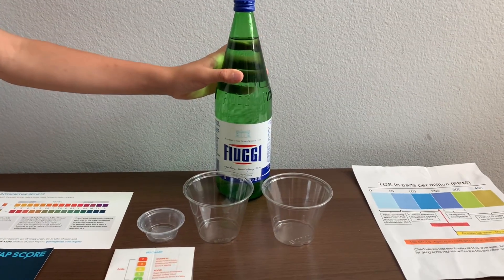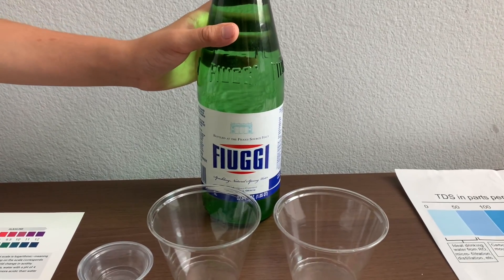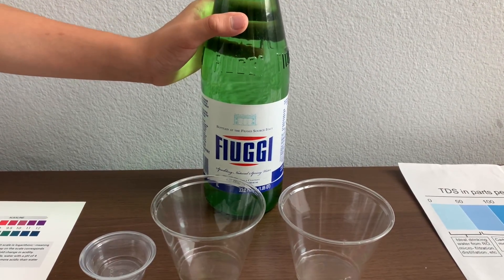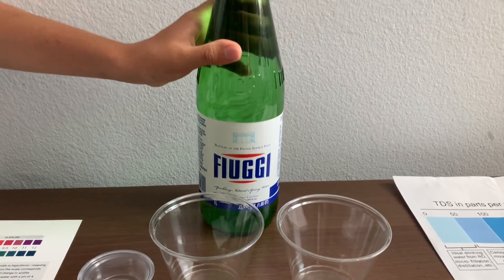This is Fiuggi sparkling natural spring water. It comes with low mineral content. It's a product of Italy. Let's pour some water in.